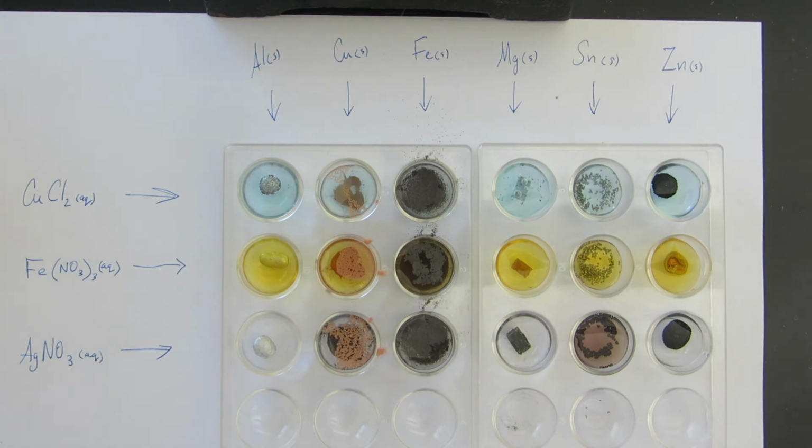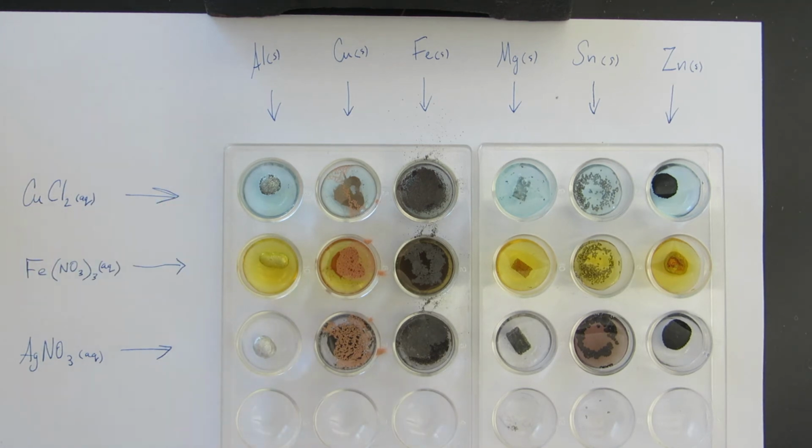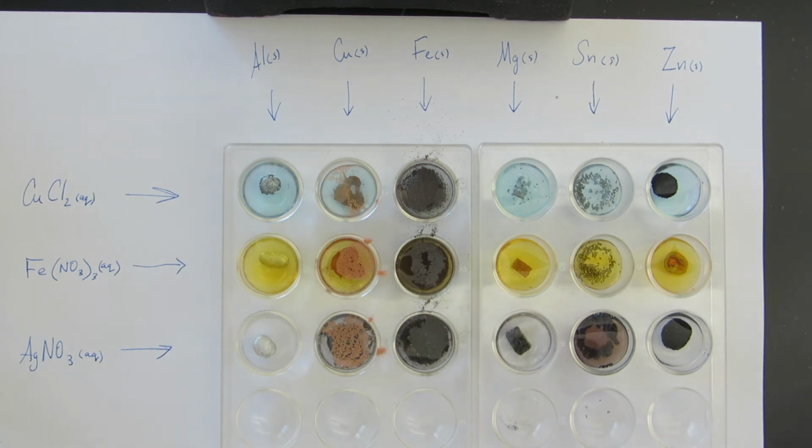One thing, you can see there is some reaction started with the copper and aluminum. So there's one thing with that, is that if you had copper sulfate instead of copper chloride, this reaction would not take place. So I'm going to go ahead and add sodium chloride to these. So shouldn't, right? The sodium's not reactive with this.